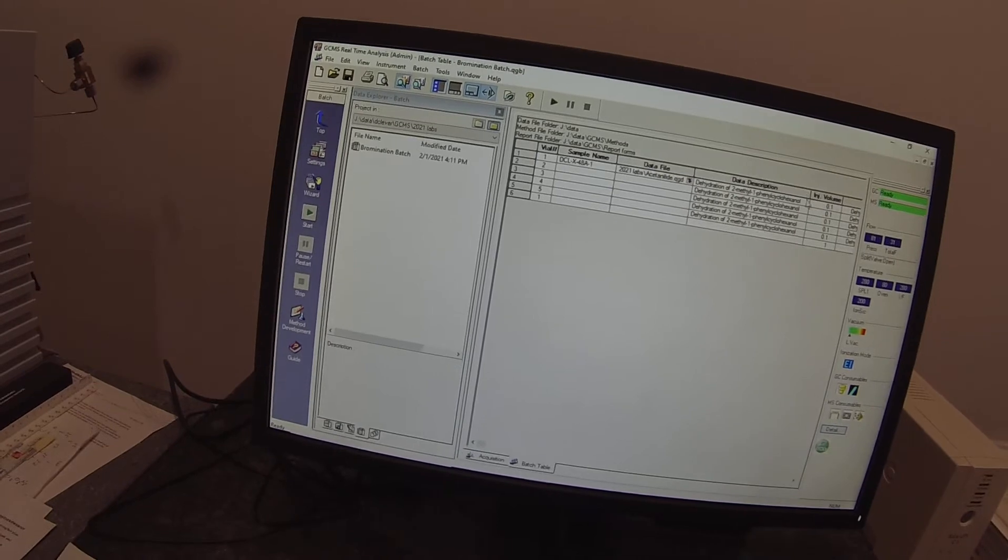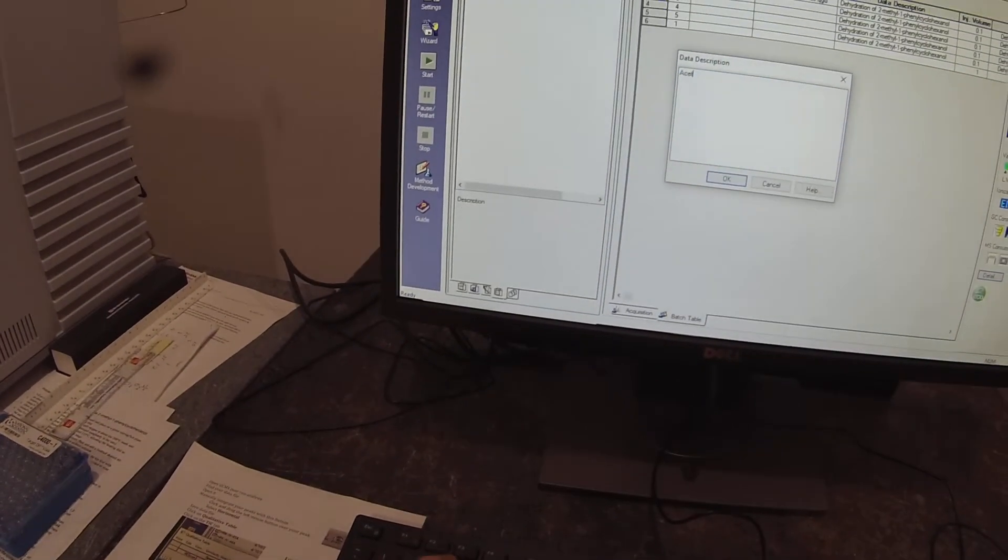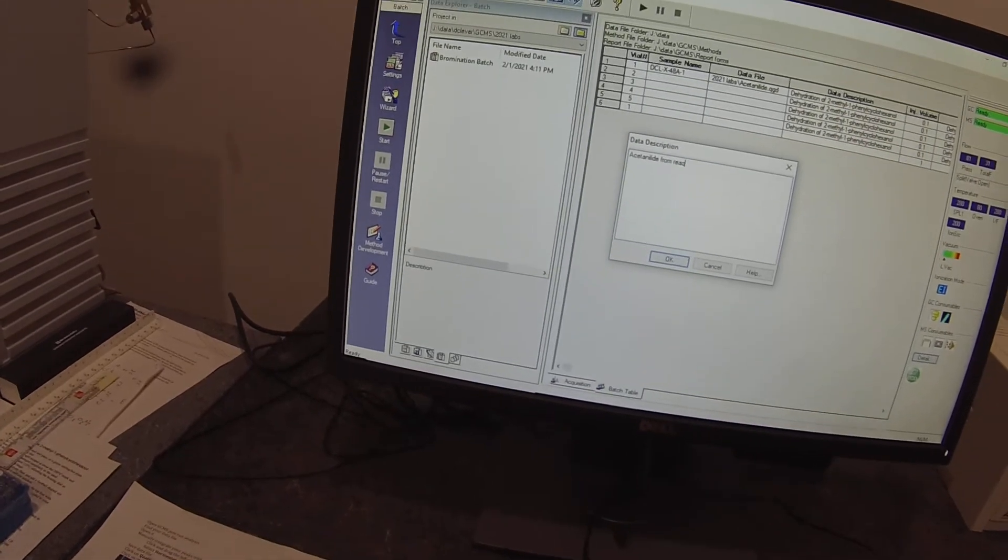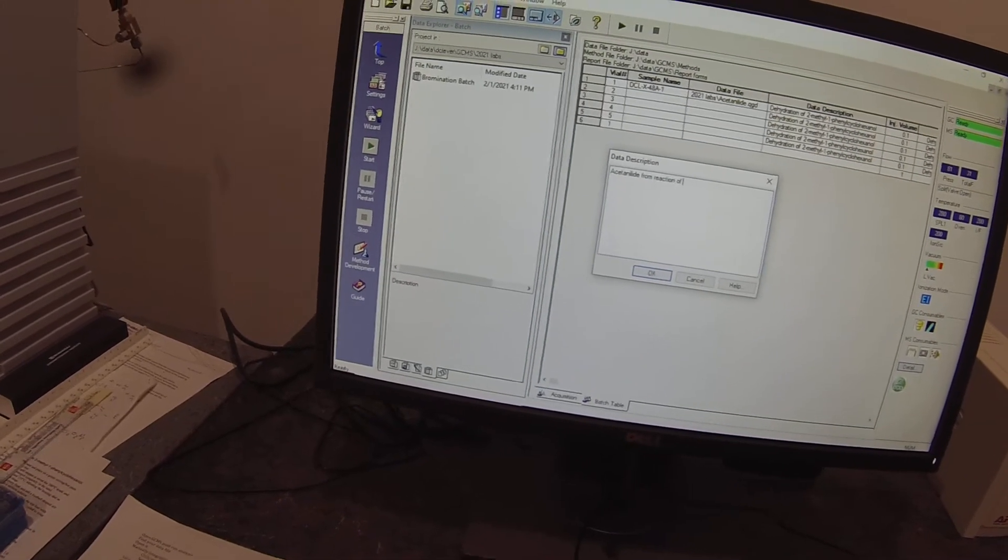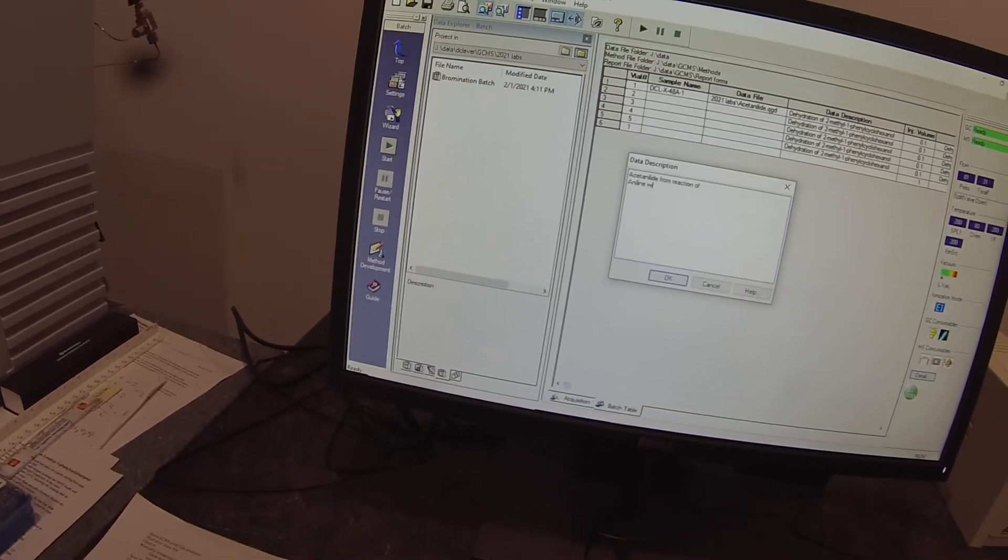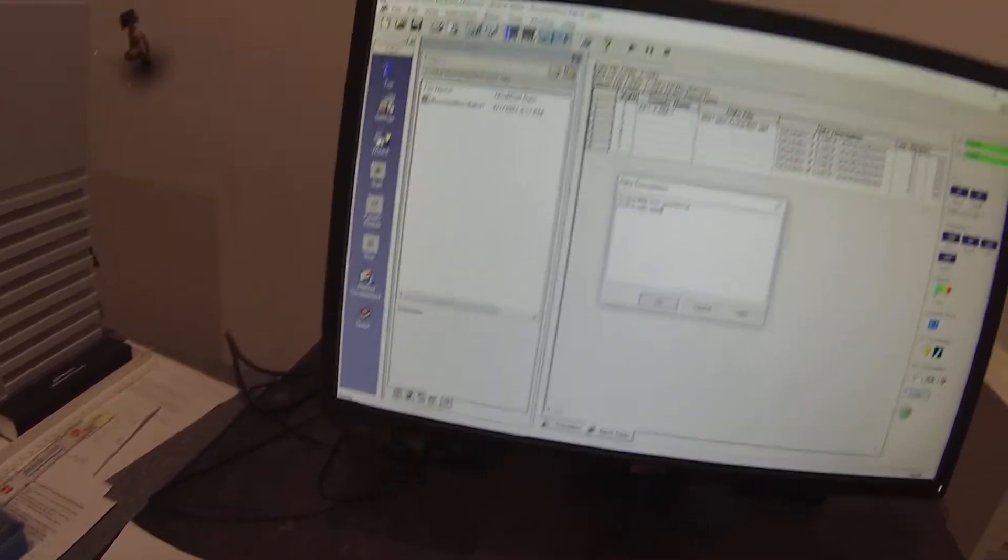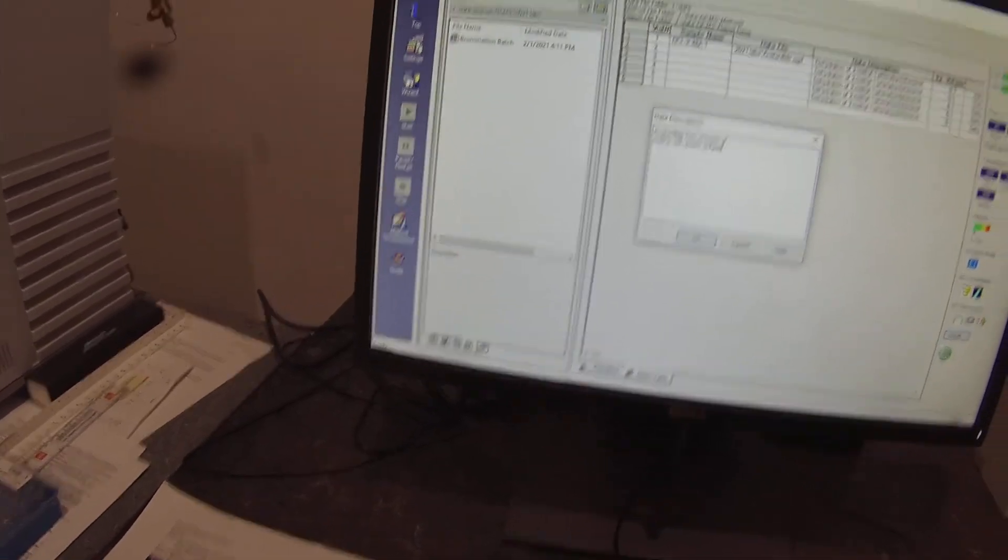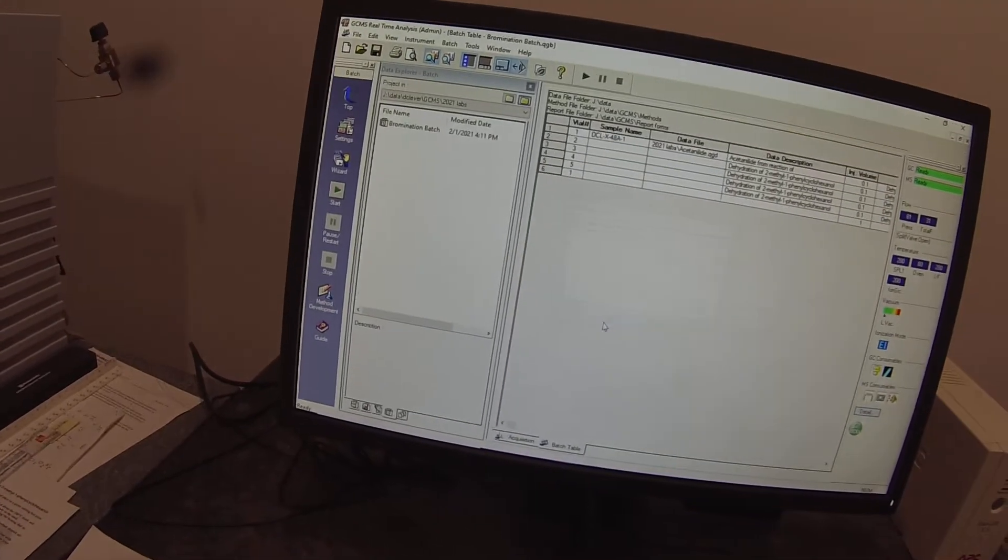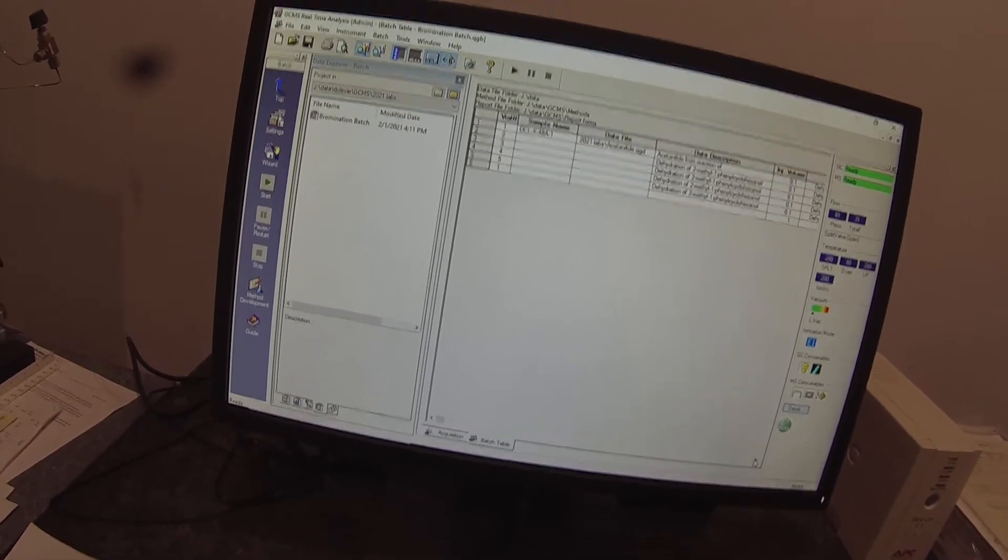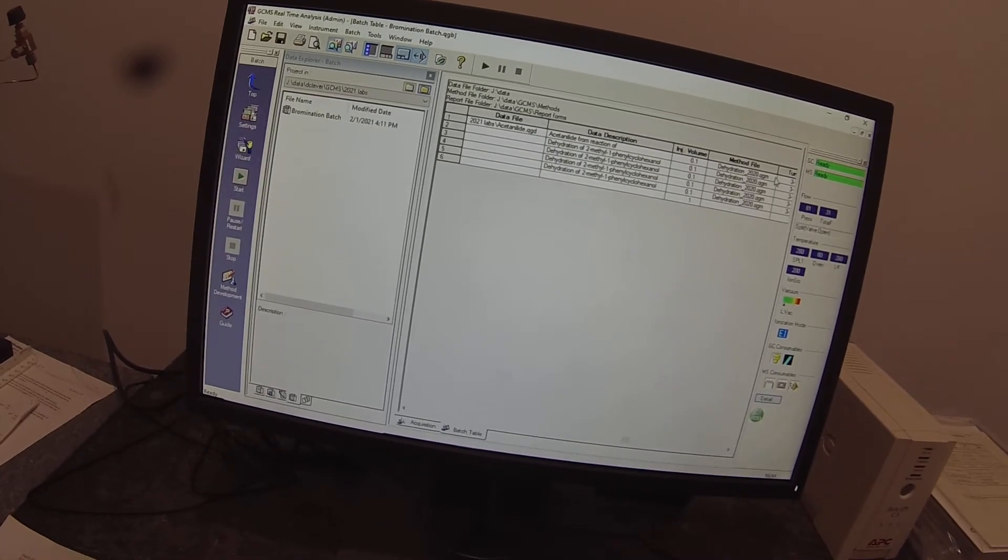And then I've got to give it a file name. And this would be the acetanilid, we hope. So under data description, acetanilid from reaction of aniline with acetic anhydride.